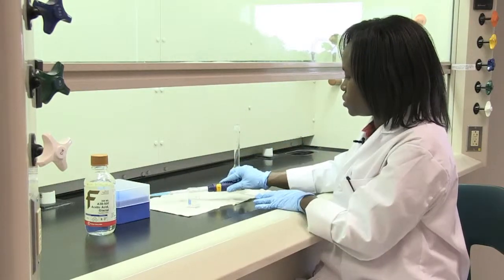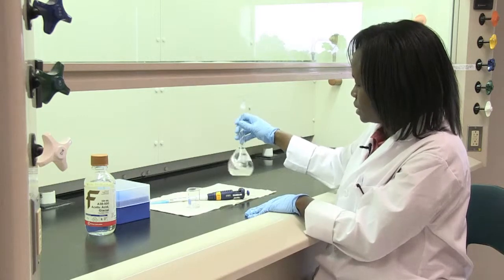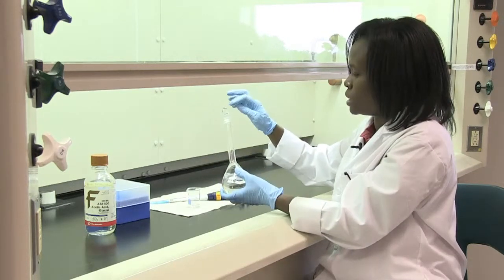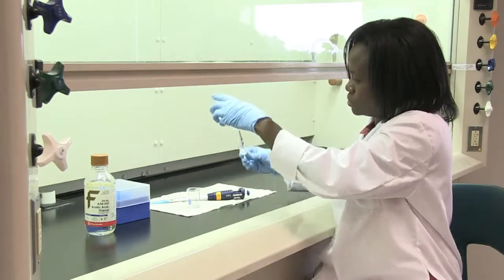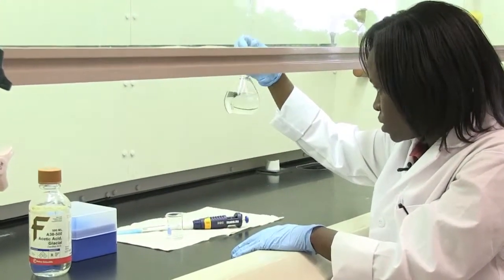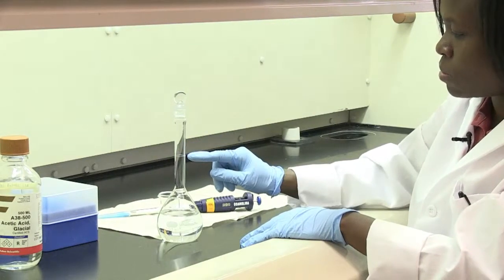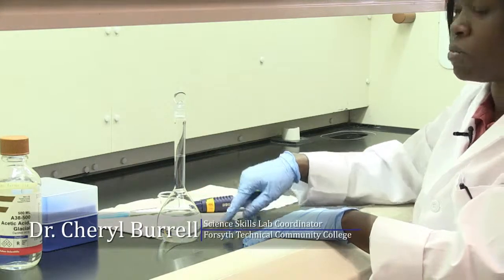Once completed, make sure to properly mix the acetic acid into your buffer solution. You can invert the flask to ensure it's mixed properly — make sure you have a stopper placed on your volumetric flask so your liquid won't seep out. Gently mix, then look at your liquid to make sure there are no more crystals and it looks clear. Finally, add water up to the 250 mL mark, since this is a 250 mL volumetric flask, and you will have successfully made 250 mL of your acetate buffer solution.